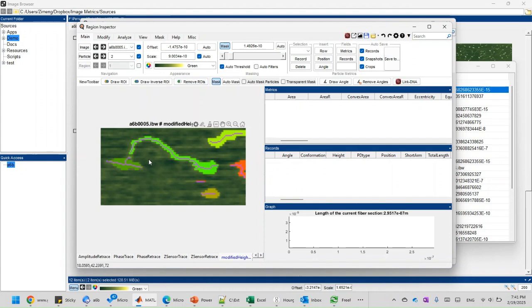Now you see it's already disconnected because you can tell by the color, right? If the masks are disconnected, you see them in two different colors. Further do that. Okay, now I have three, maybe four components here, right? So let's say this is the case. Imagine we have a very noisy image, we do the auto mask, and it still does not connect the DNA well. It's still truncated into several pieces.